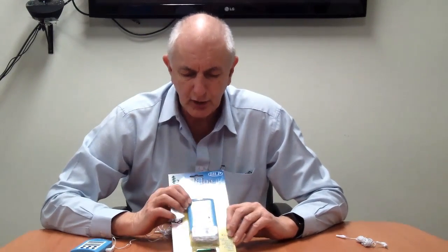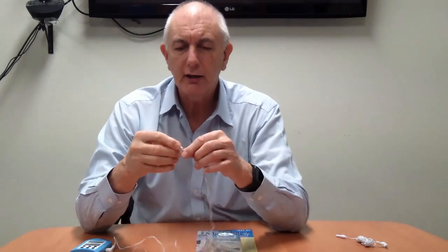It's a small unit that comes with a probe. The probe is on a three meter wire, it's waterproof, and the wire is thin enough to go through a door seal of a fridge without letting in any cold air. So you can put the unit on the outside of the fridge and this can be run through the door seals into the back of a cool room or a fridge.